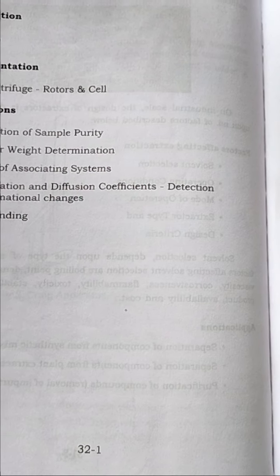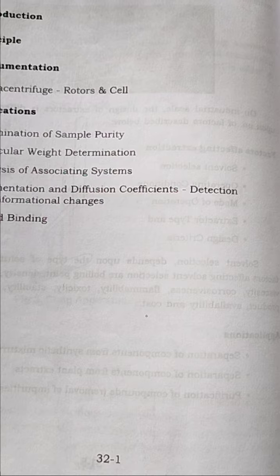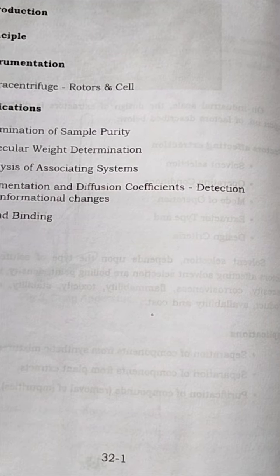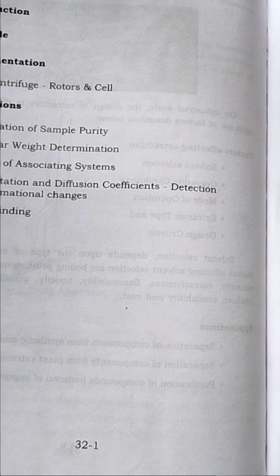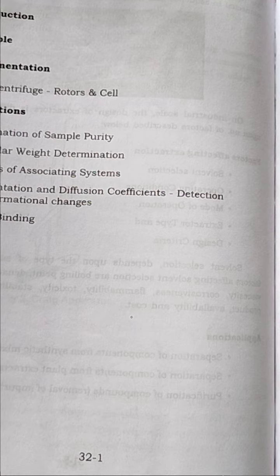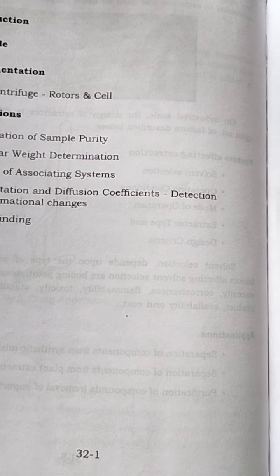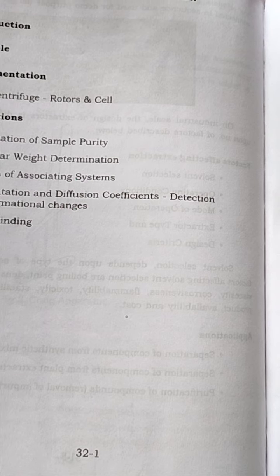Specially designed centrifuges are used to detect the proteins, which can be separated into multimeric states based on the sedimentation rate. These procedures give a molecular weight profile of compounds, by which the multimeric state of that molecule can be known.